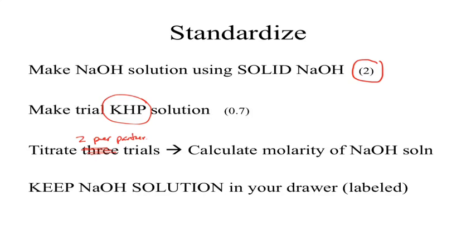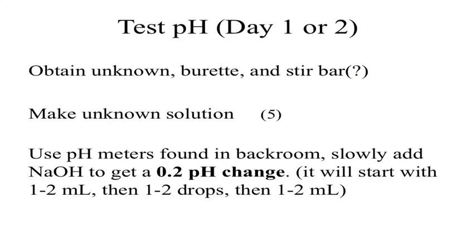If you decide to stick around, you won't keep the solution in your drawer. You will immediately move on to the next part. Okay? If you do decide to leave, you just label the bottle, put it in your drawer, and just kind of hold on to it for next week.